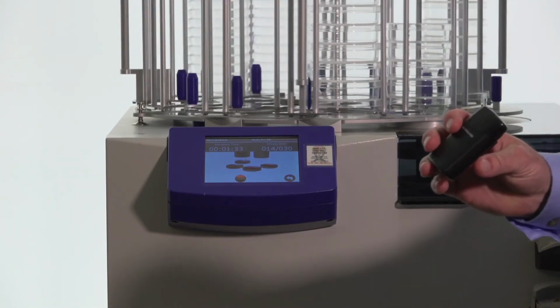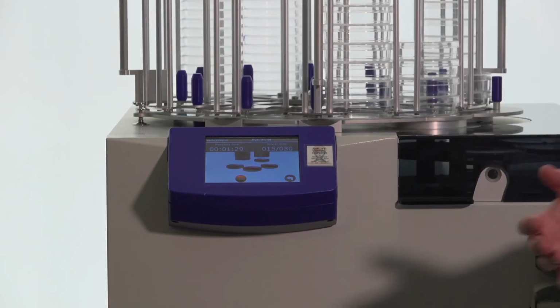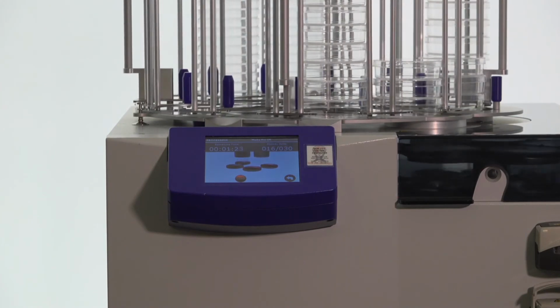So this is a pretty nice little device that you can carry with you. That way you don't have to stand here. If we are going to make walk-away automation, it should be truly walk-away. And that's what this pager allows us to do.